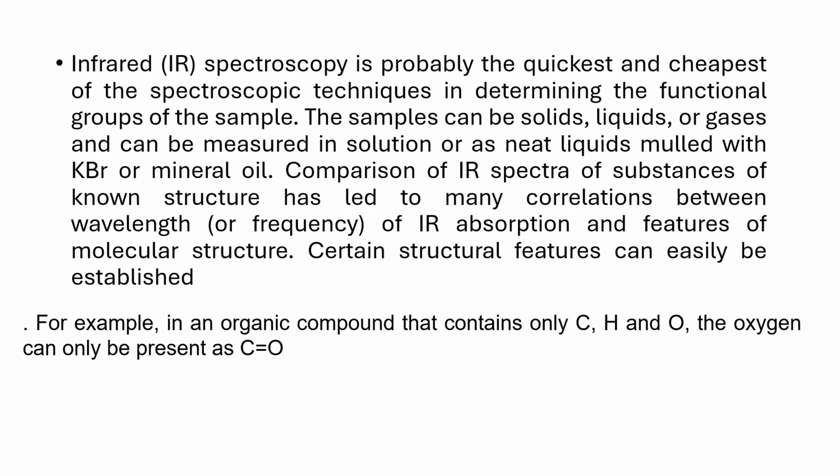Now, just as I mentioned earlier, organic compounds contain mainly C, H, and O. Of course, nitrogen, phosphate, etc. are also present, but the major components are CHO. And the arrangement of CHO with each other is going to be of different forms. And you need to differentiate, then only you will be able to talk about what the nature of the molecule is. For example, if you talk about glucose, it is the aldehyde form. But if you talk about the keto form of sugars, it becomes C double bond O. So we need to identify these because these small things, the arrangement of atoms within a molecule and the type of bond, are going to decide the functionality, the reactivity, the nature, the property, the characteristic of the molecule.